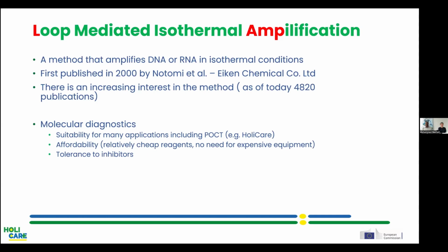As of today, there are exactly 4,820 publications. But for molecular diagnostics, the method is also very interesting, and it has very big advantages. One of them is its suitability for many applications, including point-of-care diagnostics, as Amman has just mentioned. We are involving this method in our HoliCare project, and the panels delivered in this project will be working with the LAMP method.